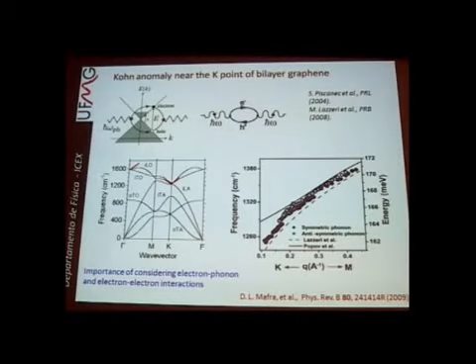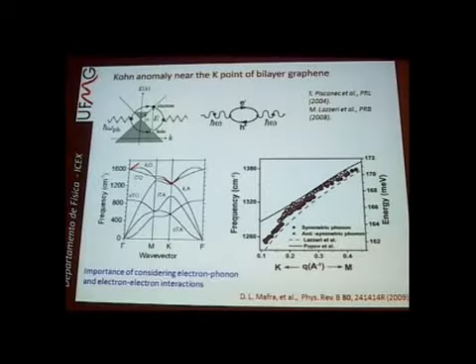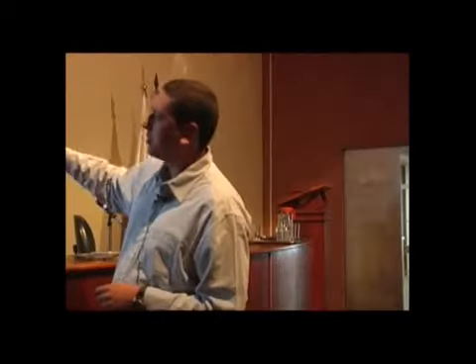So you see here that this is the phonon frequency. This is the distance from the K point. You can see that if you don't consider the electron-phonon interactions, you don't have the Kohn anomaly, but you have to consider electron-phonon and electron-electron interactions. So you have this decrease, like a damping, of the phonon frequency. So this is the Raman data that probes the Kohn anomaly.